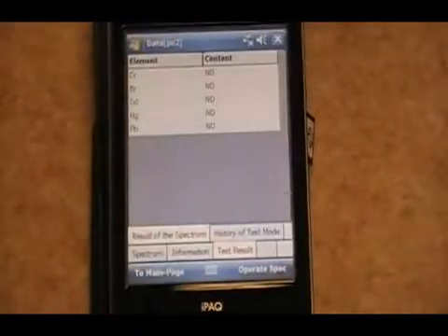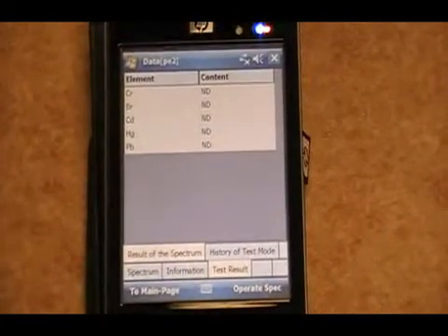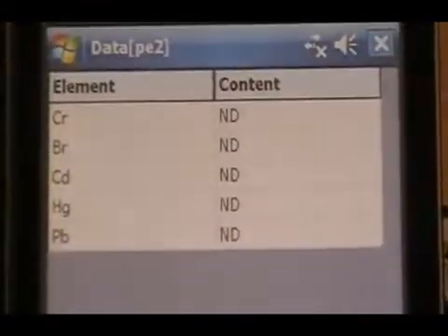It accepts that program name, and then we'll move to the standard. In this case, I'm going to the PE blank.